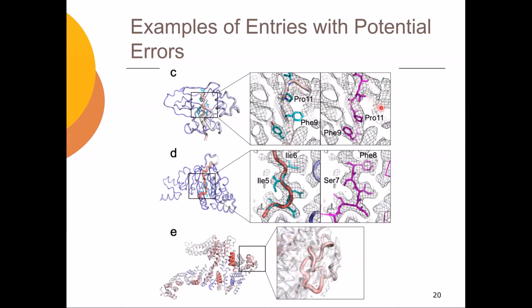So now, we actually ran AlphaFold to see how AlphaFold models this structure. AlphaFold doesn't look at the density at all, it just models structures, but it fits better to the density. As you see, this residue is now shifted here, which fits better, and this phenylalanine fits better, like here. So this is basically a residue shift. The main chain is okay, but the residue shift seems to be happening here.